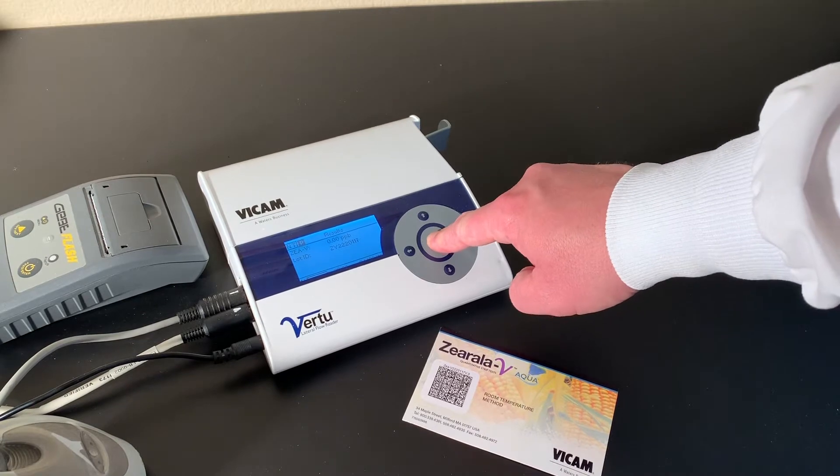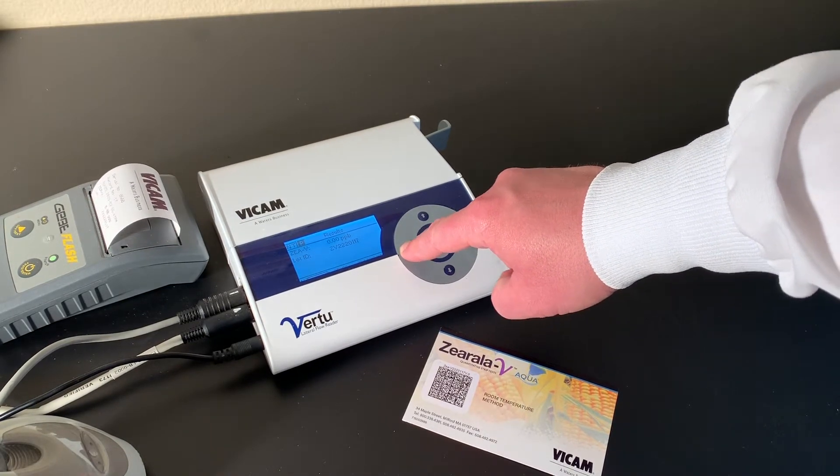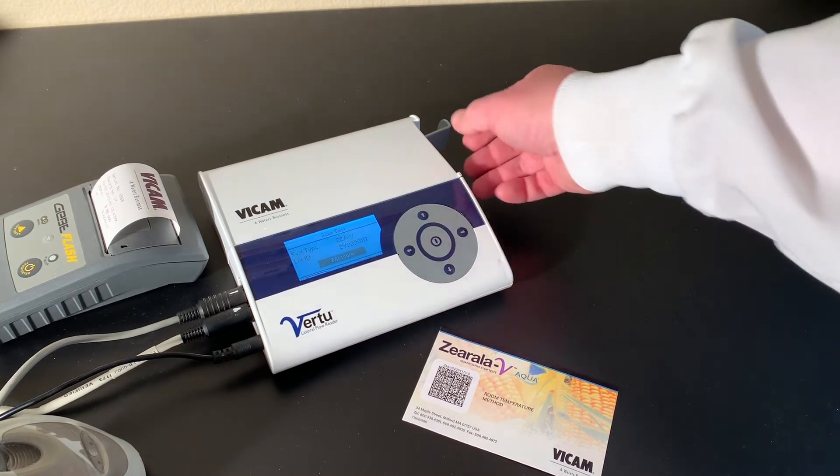Press the right arrow to move to P. Press the center button to print your results. Press the left arrow to move to NT for the next test, then press the center button.